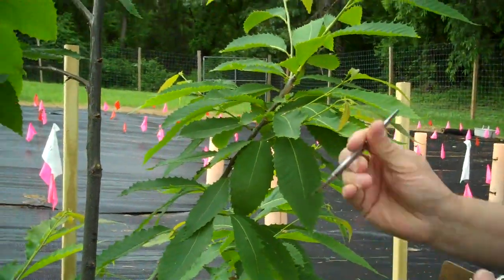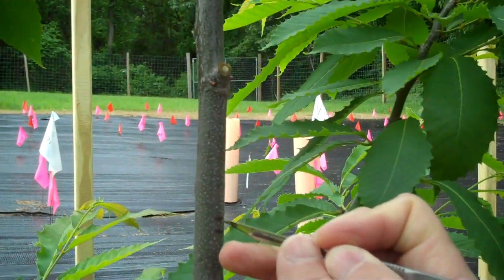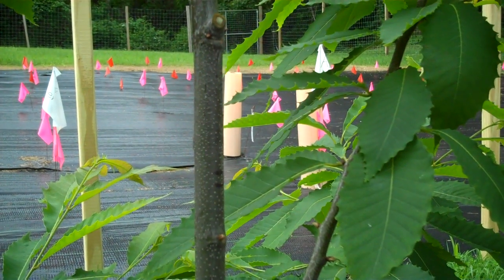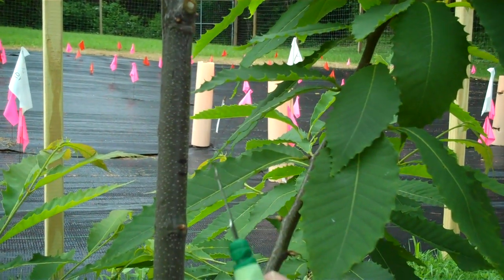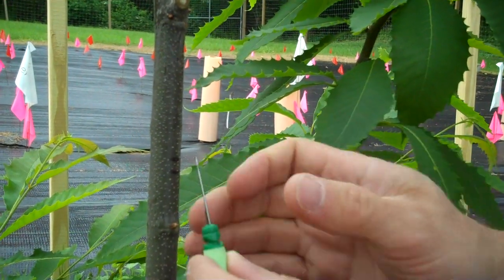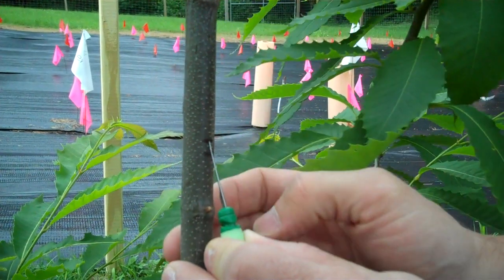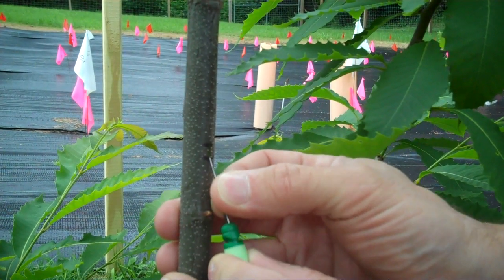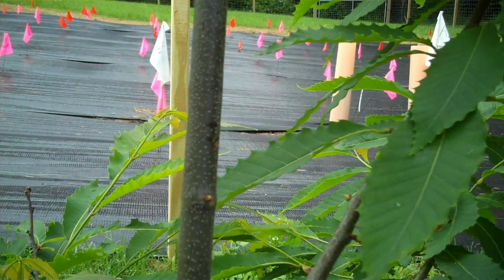I'm going to take a pointy scalpel and go to the center of this to make a little hole. Then I'll take this little device called a knit picker — I'm using this so I can make a wound of equal depth on all the trees. I put the little hook into where I just made the wound and pull it down to the bottom. That makes a pretty nice even wound, so all the wounds should be about the same size.